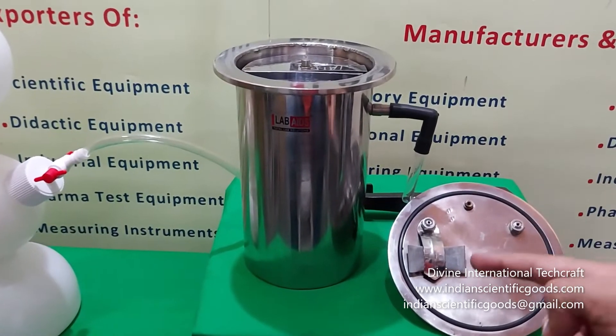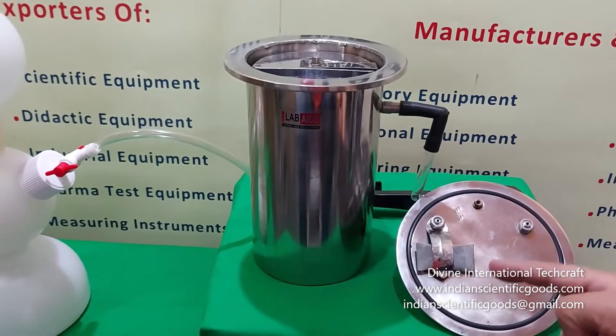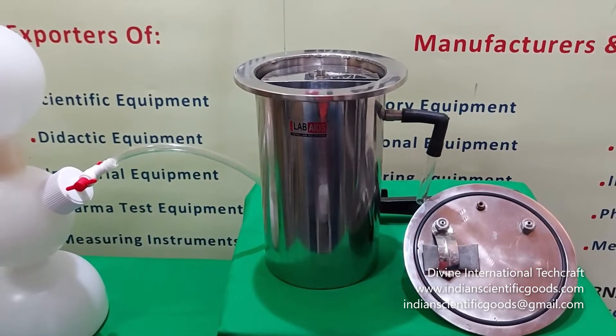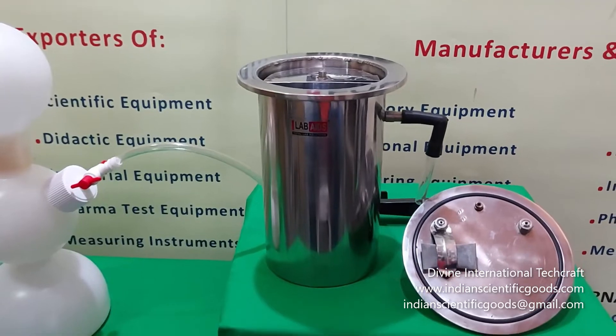A special catalyst is provided in a sachet that hangs inside the lid. It combines the oxygen remaining after evacuation to 10 cm of mercury with the large excess of hydrogen.